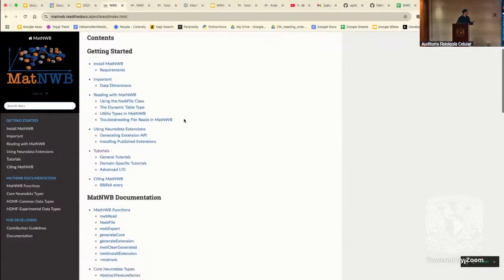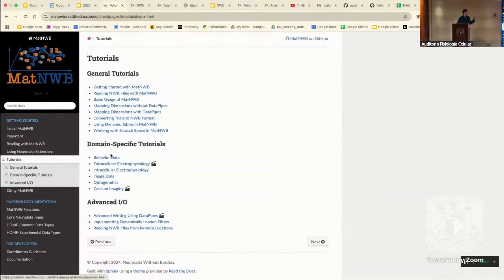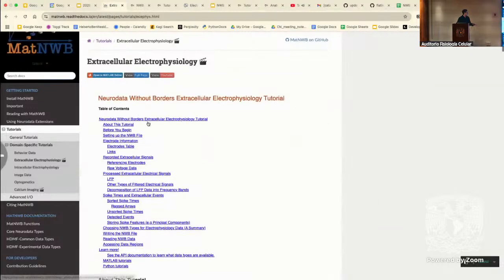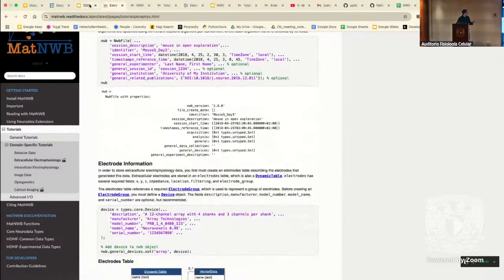And again, you have some basic tutorials of how to read MatNWB, but the complete equivalent tutorials will be there. And it goes through everything. For example, we have behavior, extracellular electrophysiology, intracellular, image data, up to optogenetics and calcium imaging. And here I think we even have some video links that you can see of previous tutorials. So this is the structure of the documentation.